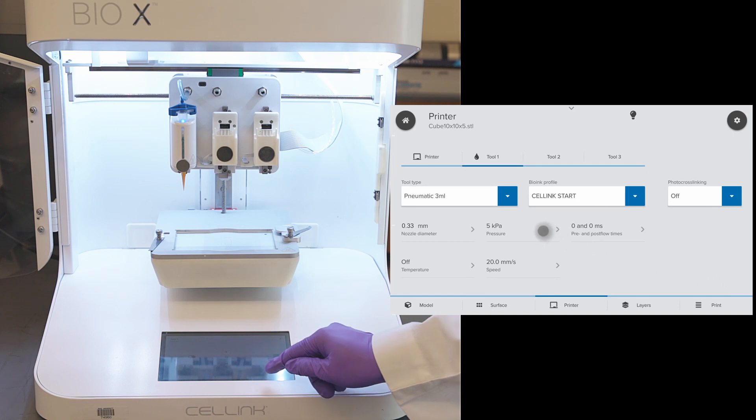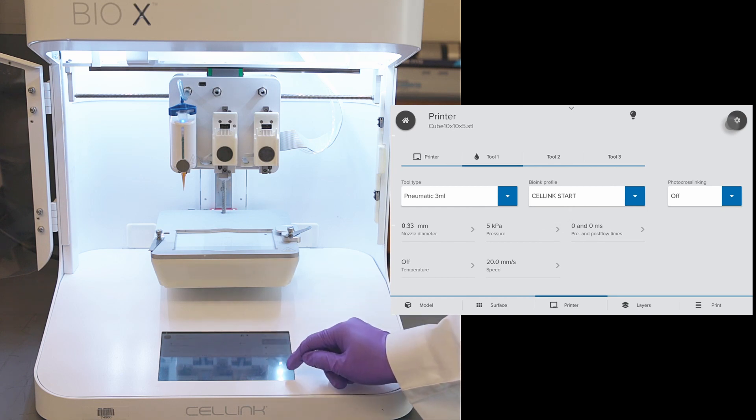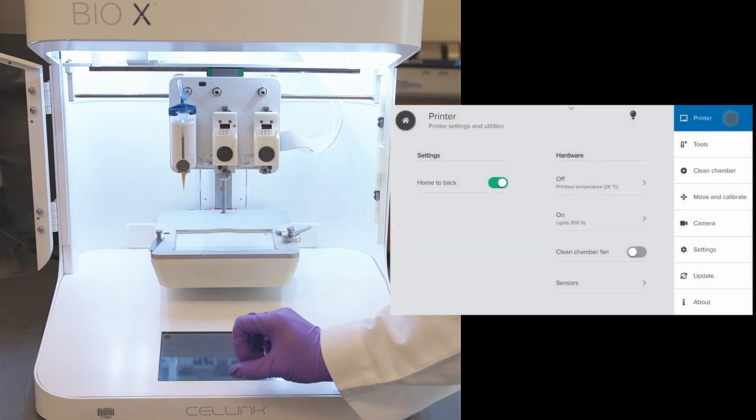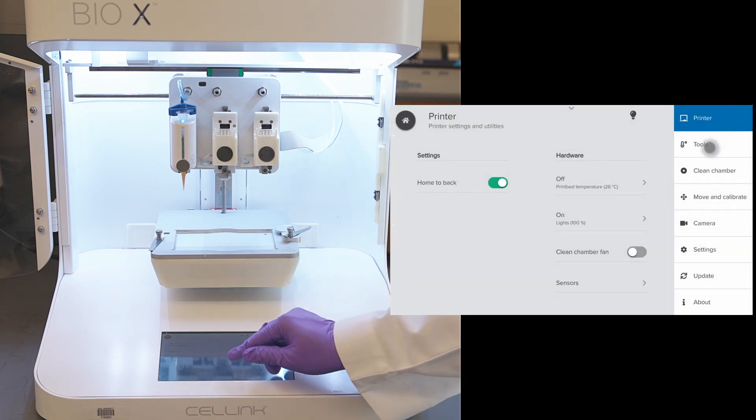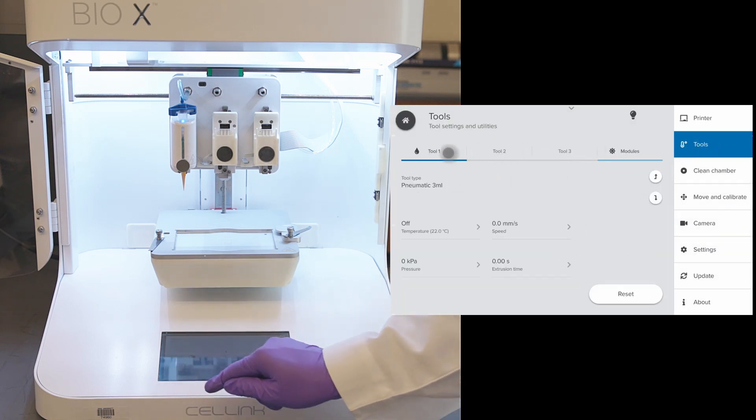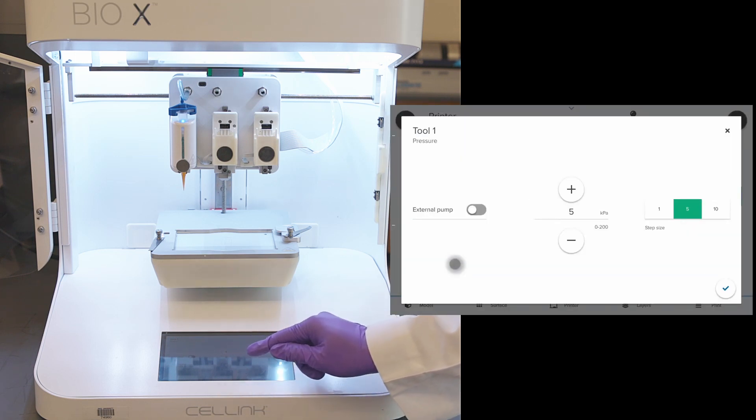Next is the pressure. If you are working with new material, we are not sure about the pressure needed for proper extrusion. In this case, click on the settings and go to tools. Select tool 1, where we have mounted the tool head. Click on pressure to optimize extrusion pressure.